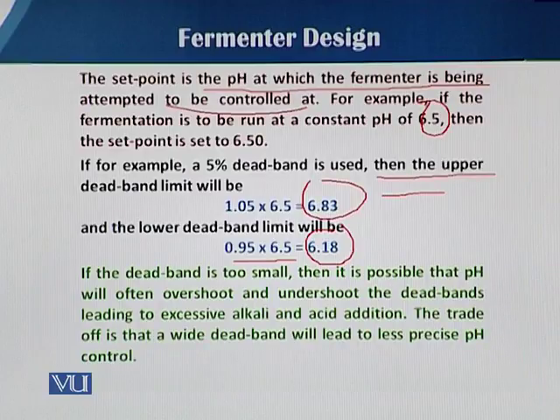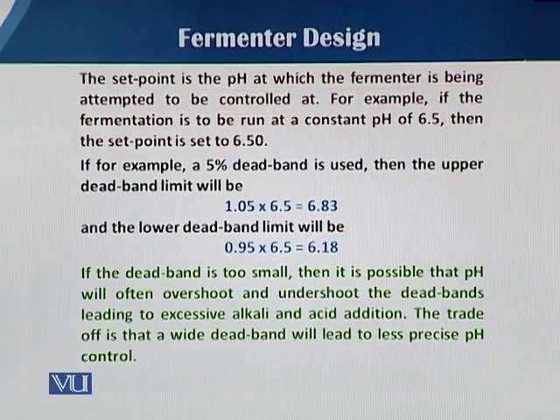So if it touches 6.83, then the acid pump will be switched on, and if the pH touches 6.18, then there will be a signal to the alkali pump. This is why we calculate the upper band and the lower band, but that depends directly upon the dead band which we decide before controlling or optimizing our processes.